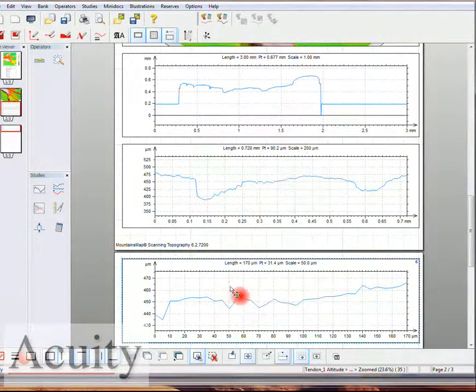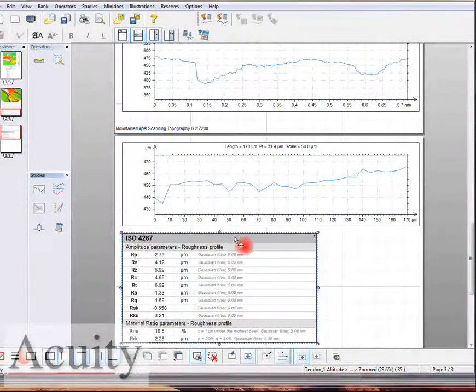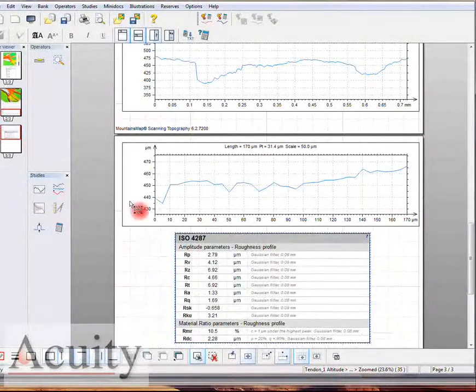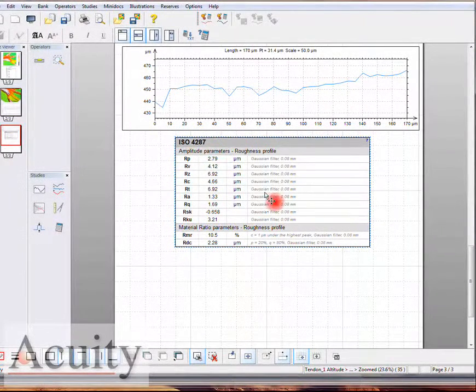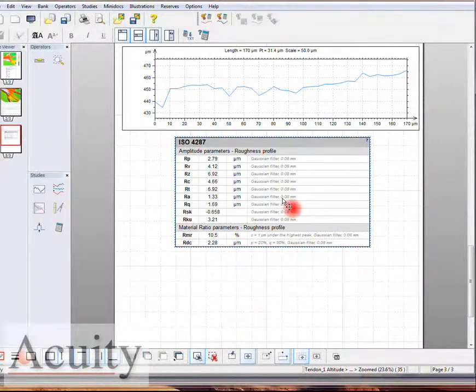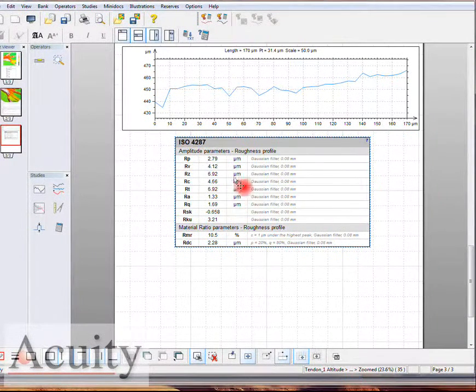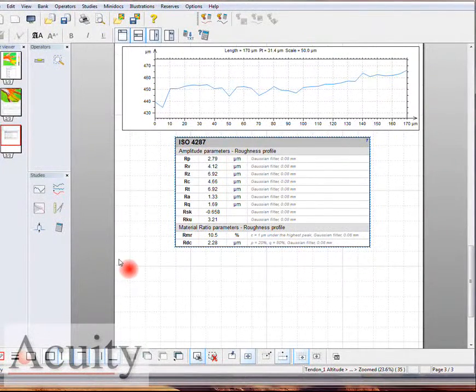With this technology, with the push of the button we can of course get surface roughness profile. We're actually calculating to an ISO 4287, and on that profile the Ra survey is 1.3 microns of surface roughness across there, which gives you a good idea.